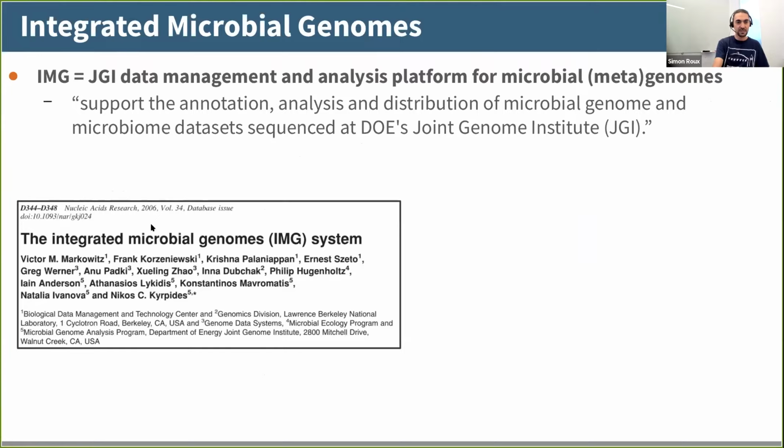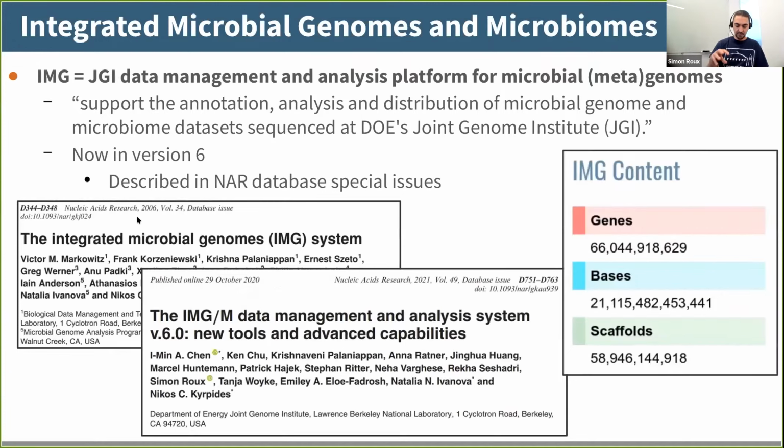This article tells you that it started in 2006, so that has been a long time. The current IMG, now called IMG/M, because it's now Integrated Microbial Genomes and Microbiomes, expanded to metagenomes and similar types of data sets, is now in its version 6. If you are curious about the database itself and the interface, the whole of IMG is described in this NAR database special issue.